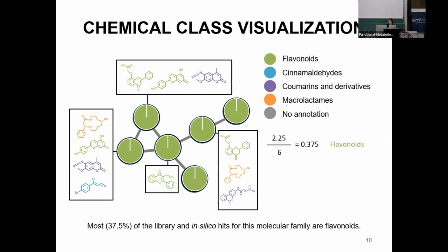So I think here it's very important to see that it's just providing you a summary data. So it's by far not comparable with a very sophisticated algorithm that Kai talked about with predicting actual chemical classes, but it's more to guide your manual structural annotation and to give you a bit of a hint where you could look for.